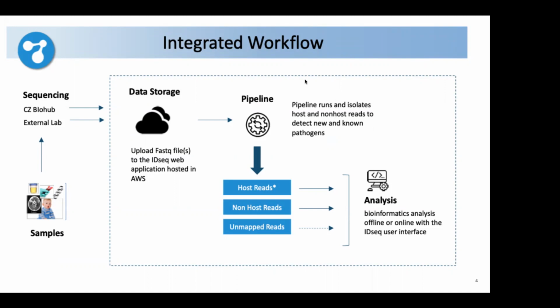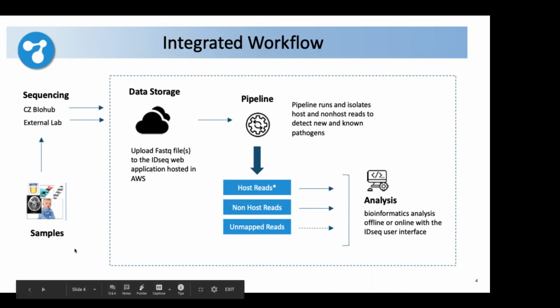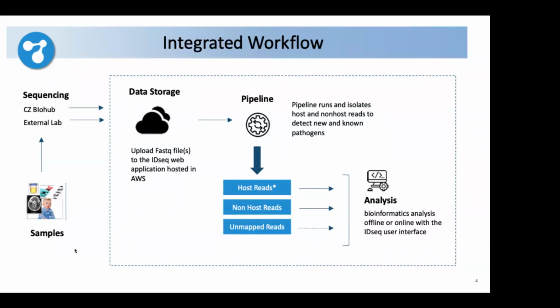IDseq is represented in this drawing by the dotted box. But if we actually start over here, this process begins by gathering samples. These can be human samples, they could be animal samples or insect samples.